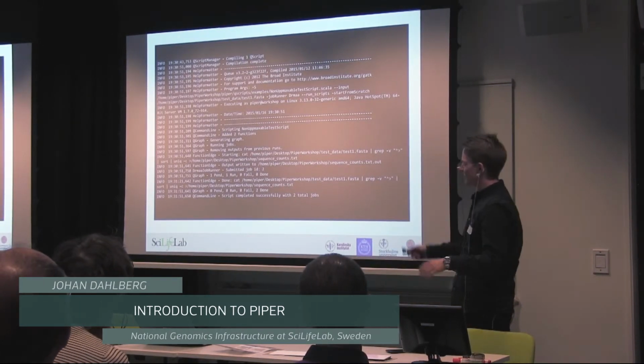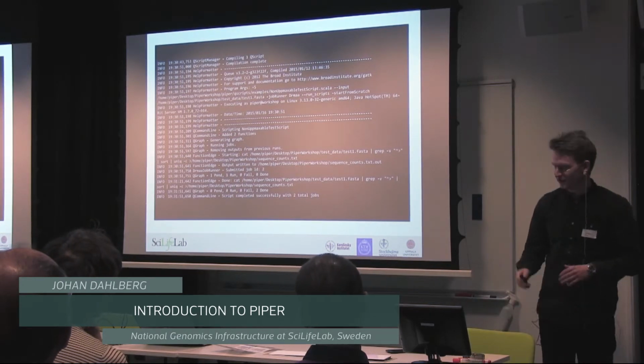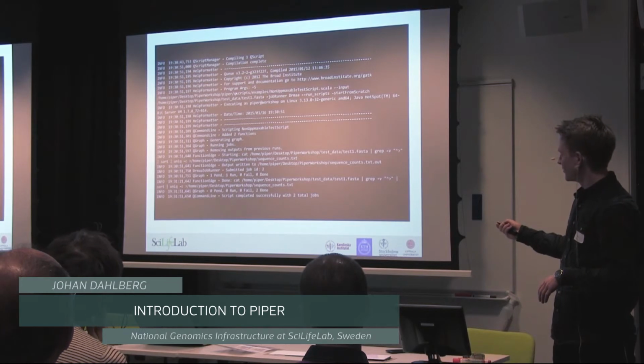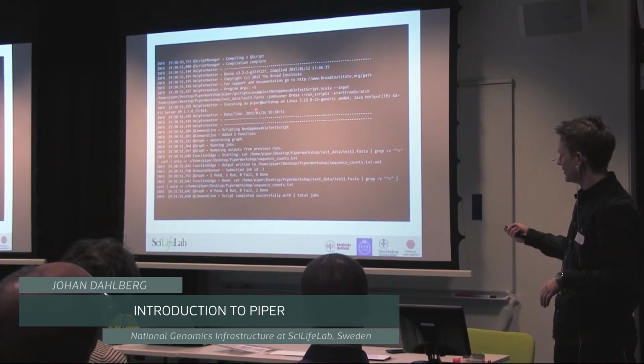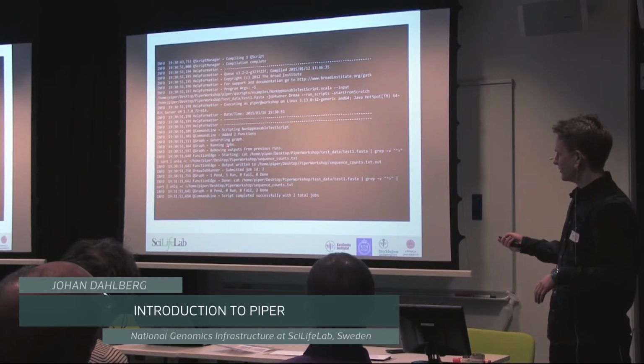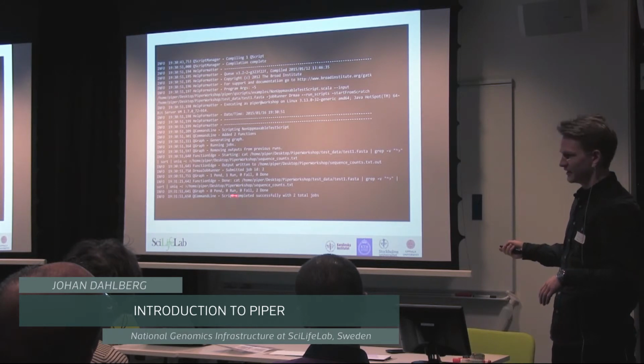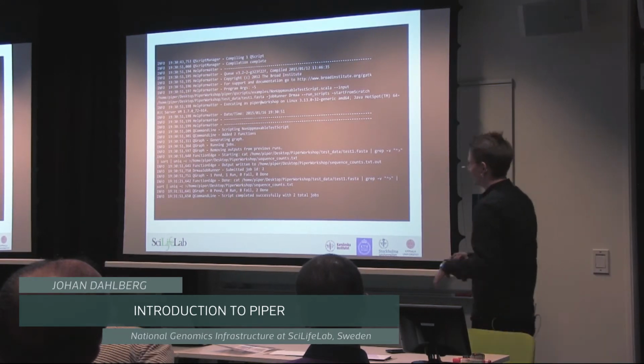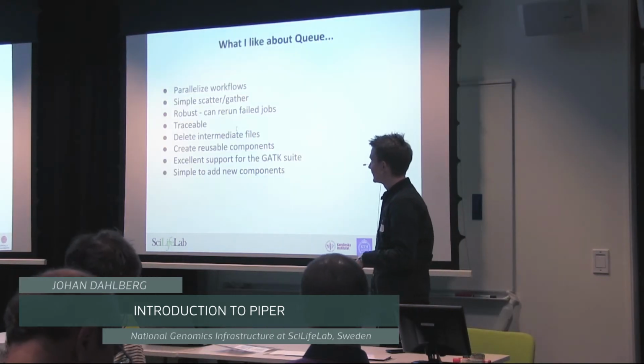You kick it off, you get something like this. I've shortened this a bit to fit it into a slide, but you will see, kick it off on a command line, it will give you back your arguments so you can see exactly what you ran, dates and times and so on. Starting to run, and hopefully you end up with something like this: script completed successfully. And all is fine with that.